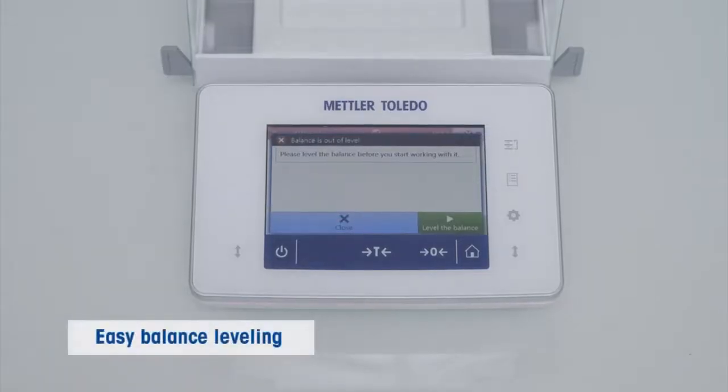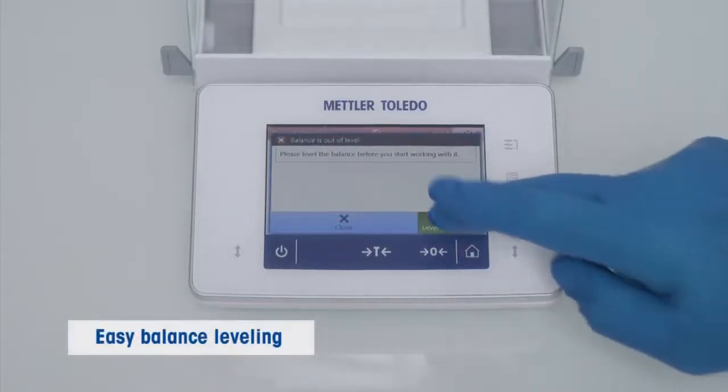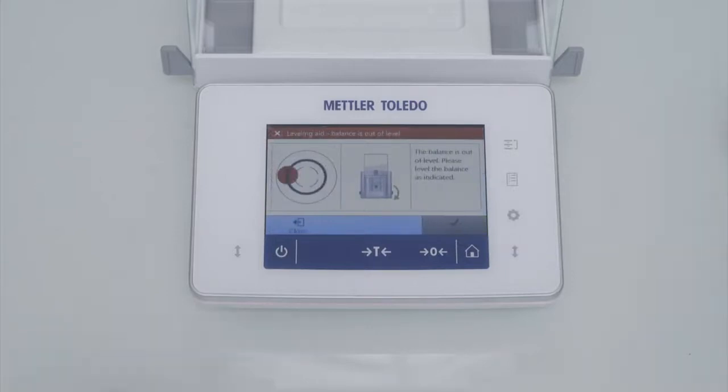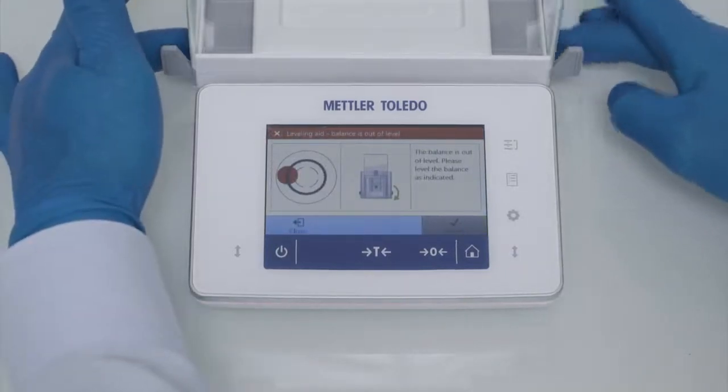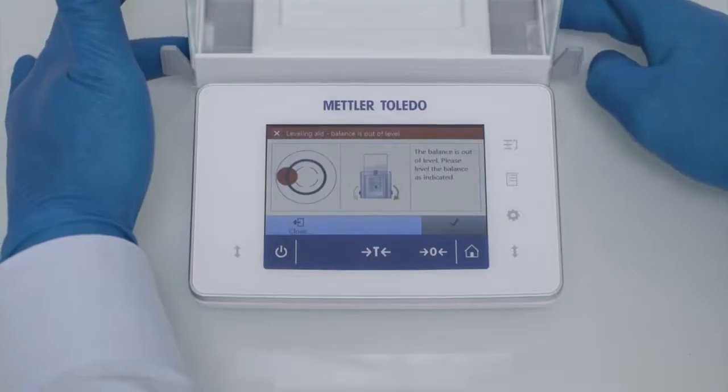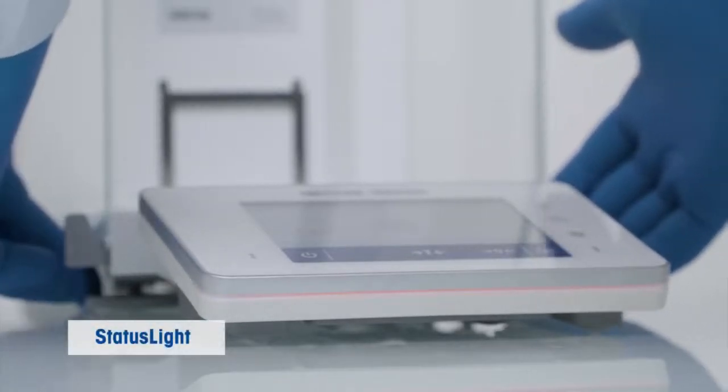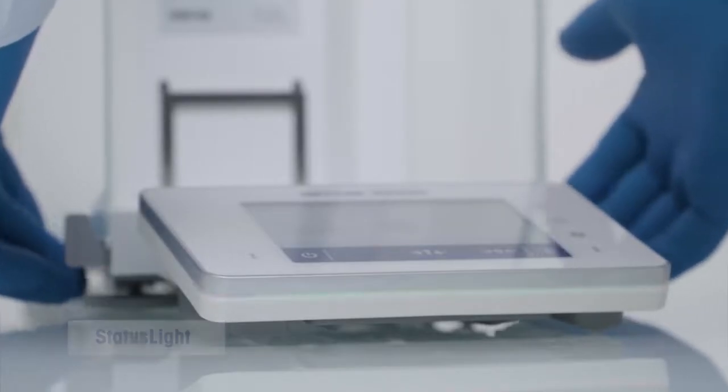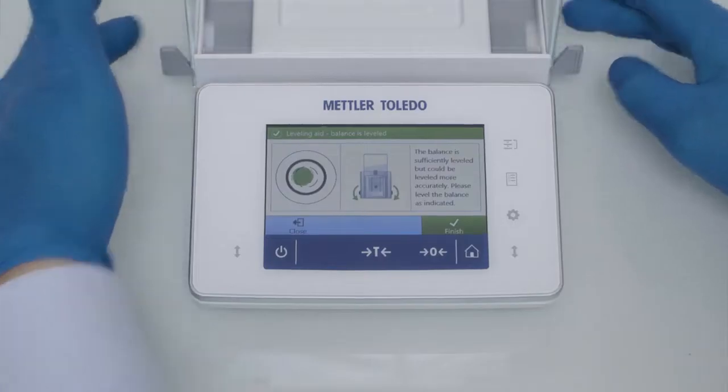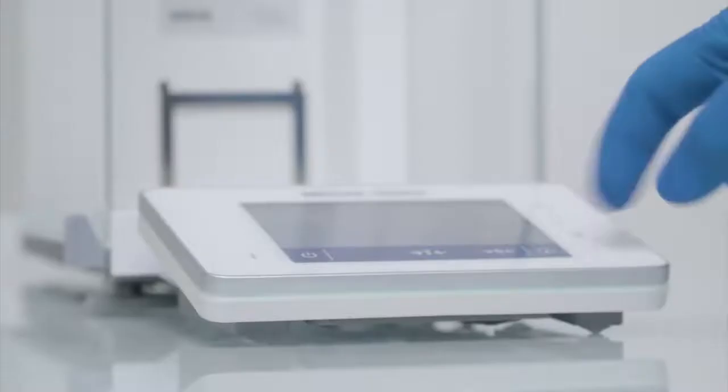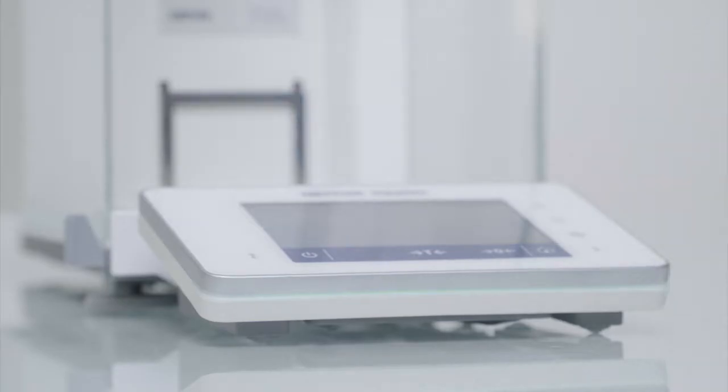First thing before you start weighing is to make sure the balance is leveled. The level bubble on the terminal display indicates the level status in green or red. The two level feet are conveniently accessible from the front of the balance. The status light indicates that the balance is ready to be used, for instance if it's leveled. Green means you can go ahead, red means it needs your attention.